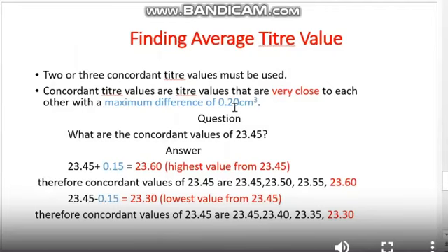But in WAEC, it is advised you make use of a difference of 0.15 cm³, so that by mistake, even if it exceeds 0.15 cm³, it will still land at 0.20, so that by mistake you will not exceed 0.20. So in this our work, we'll be making use of the difference of 0.15.